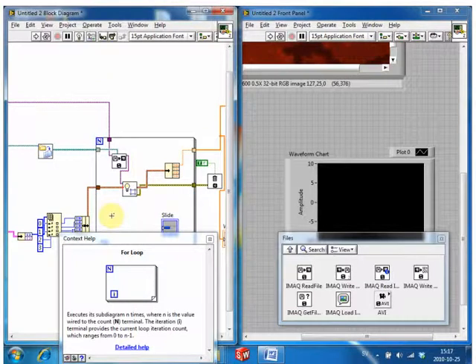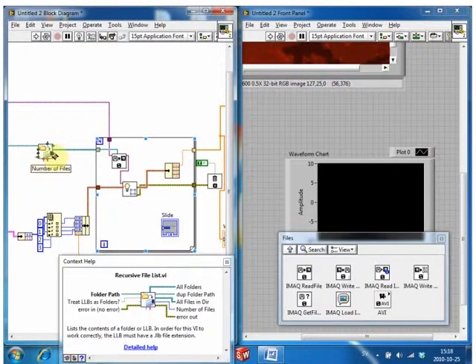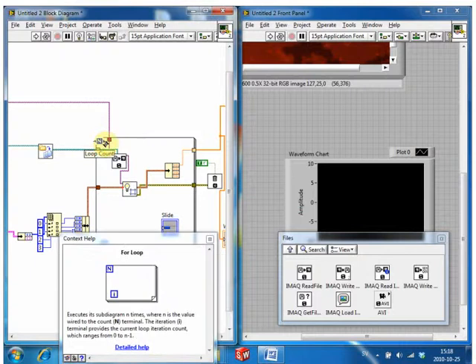No, he wants to know if you can use n instead of this file number. Yeah, I mean, you can... I don't know. We can stick an indicator on here and see if it actually outputs anything. Maybe it outputs it. Then it should output just n, the number of files. Yeah, but we haven't explicitly told it, so I don't know if it'll output it. We can create an indicator and see.